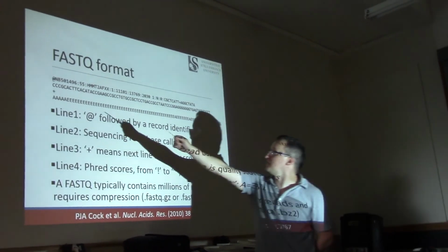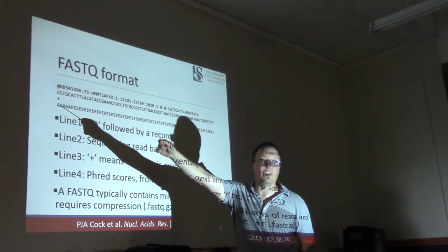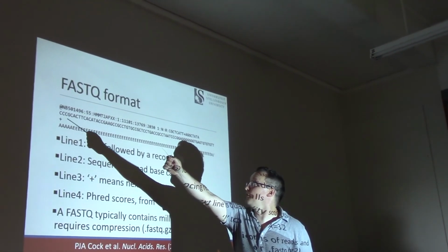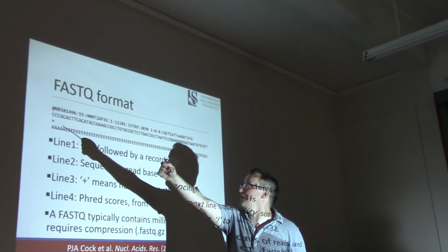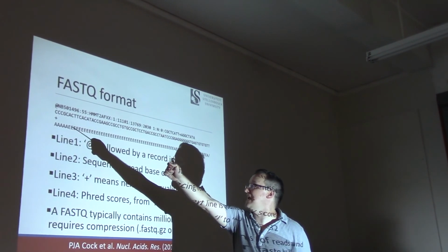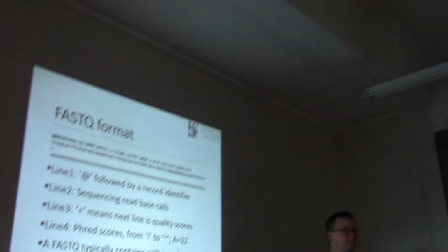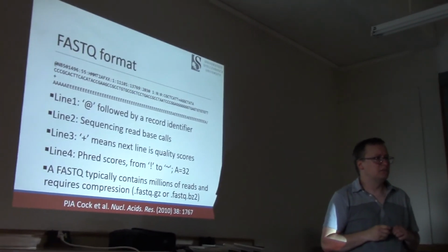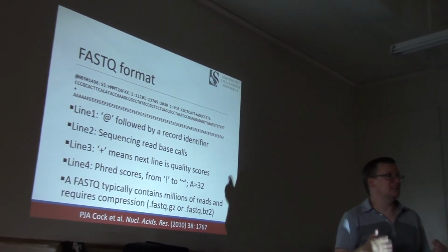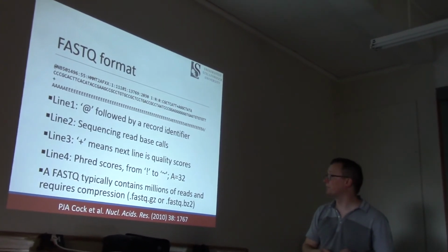So in this case, the software is saying that the first base call is C, the quality associated with it is 32. The next C corresponds to a 32, C, 32, G, 32, C, 32. This next A, however, gets a score 4 higher than that, 36. Are those acceptable base calls? For all of them, the chance of error is less than 1 in 1,000. So yeah, this is a pretty good read, in other words.